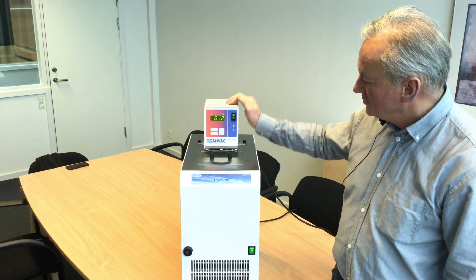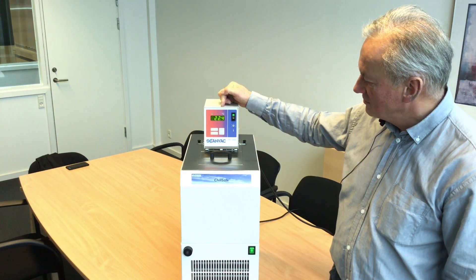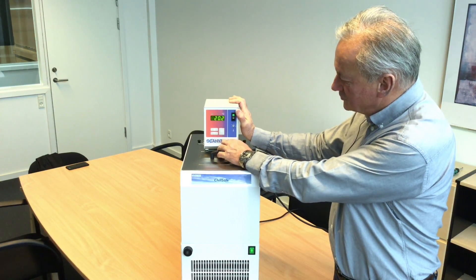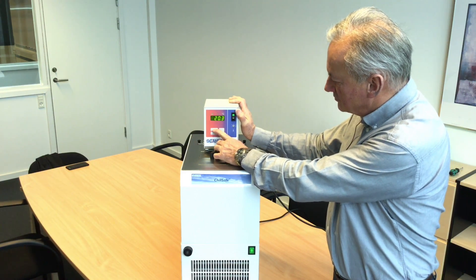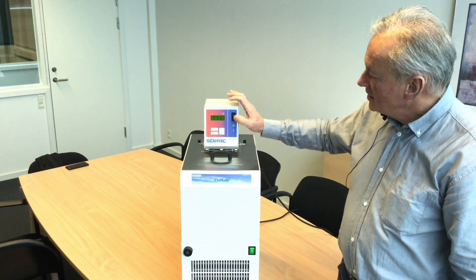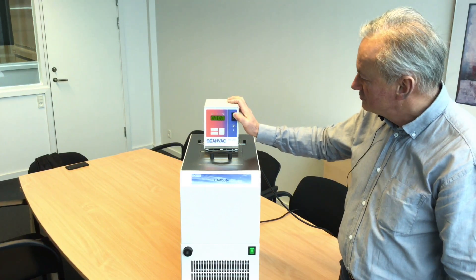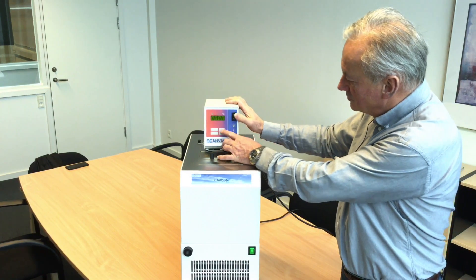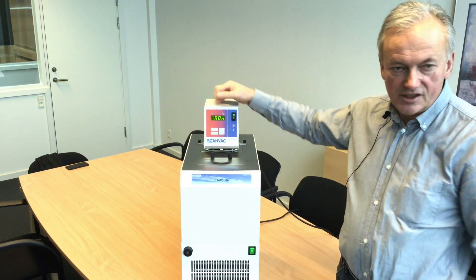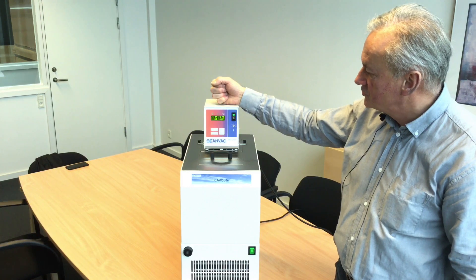Turn it on. It shows you the software version and then it starts. The actual temperature now is 22.4. You can press either up or down to see the set point, which is now 20.2. You can then go up or down, press enter, and that will be the new set point. If you like, you can also determine if the unit should start after a power failure or if you have to do that manually. You can see it simply starts. But if you press the button, you say auto off or auto on. Normally you will set it to auto on, which means that in case of a power failure the unit will start automatically and try to bring the temperature down to the set point.